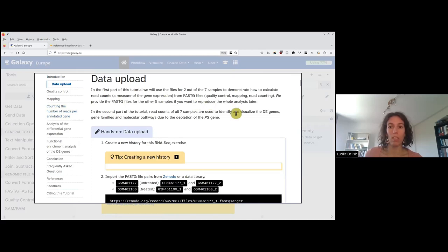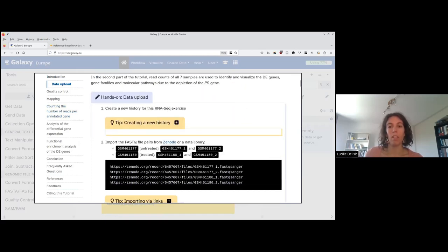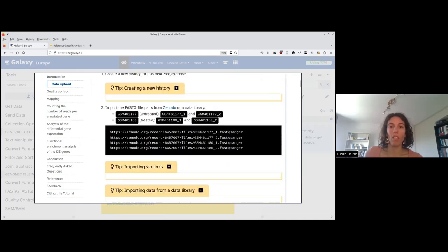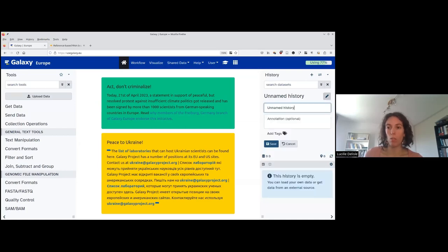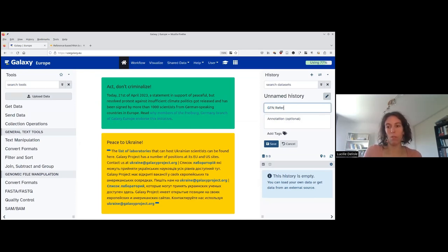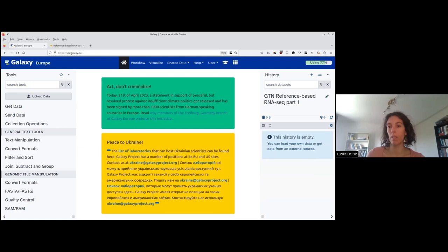So we are going now to do the data upload. There are two samples that we are going to pre-process instead of the seven that are available. The first step when you start a new analysis is to create a new history. If you don't have a blank history, please click on the plus icon to create a new history. The first reflex you should adopt is to rename it — so let's rename it 'Galaxy training network reference-based RNA-seq part one pre-processing.' I clicked on save, and now I can see the name of my history has been updated.